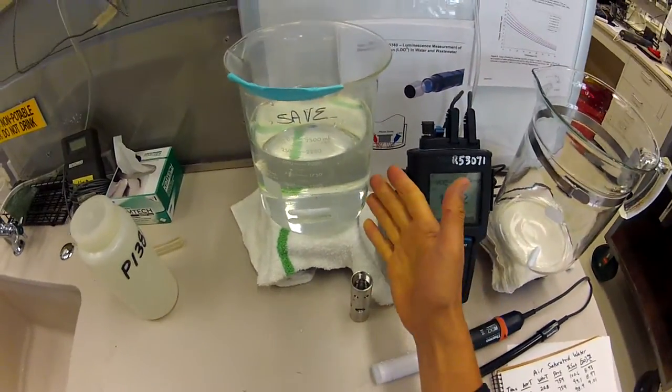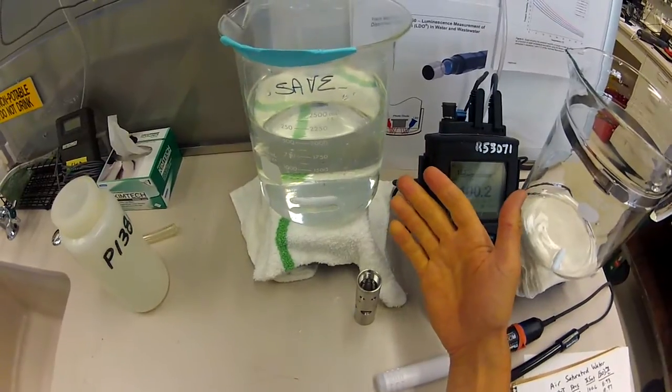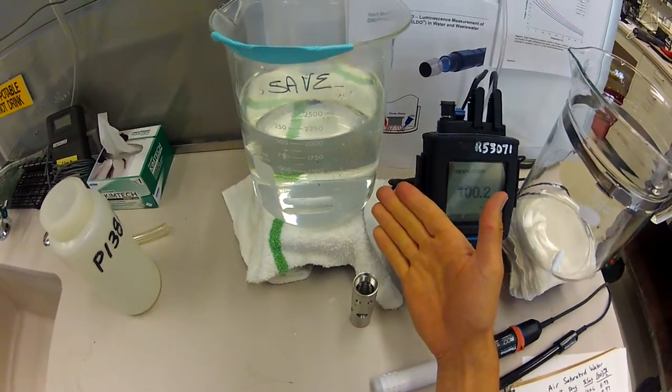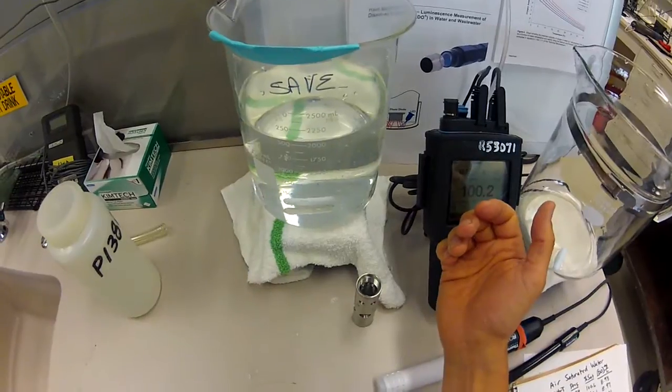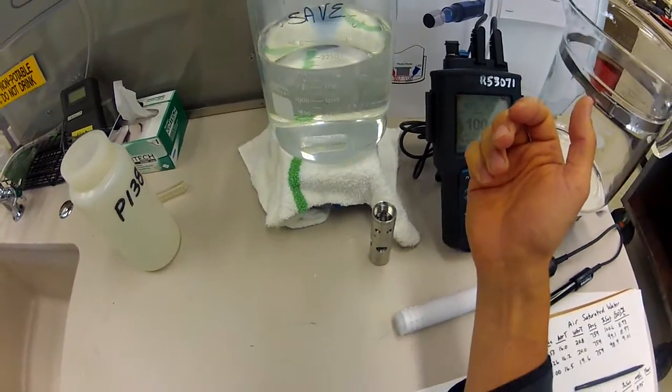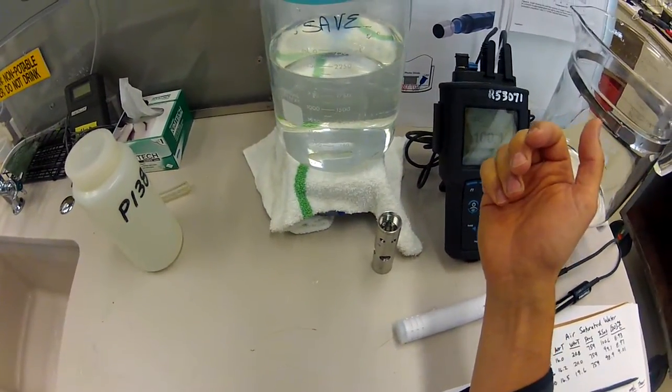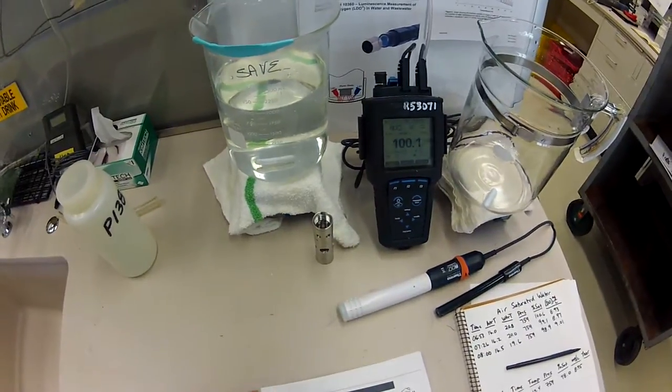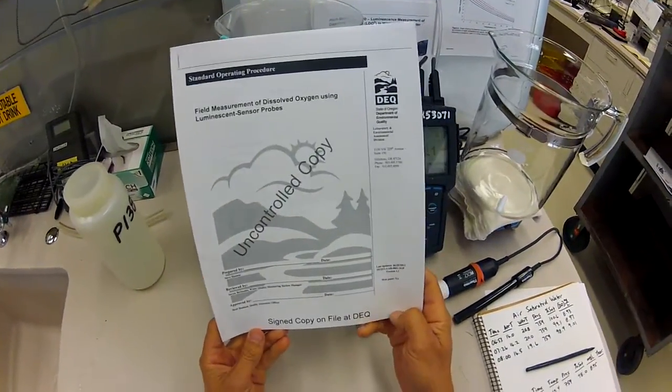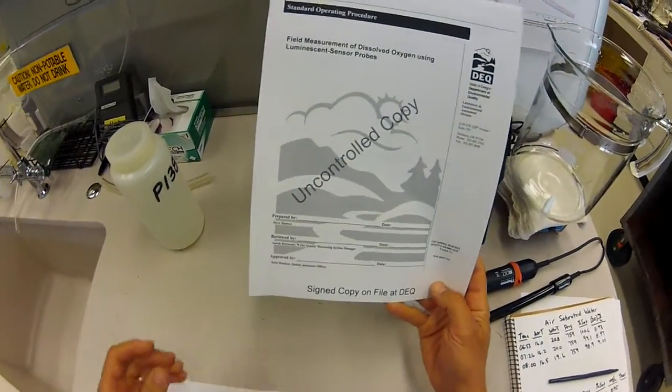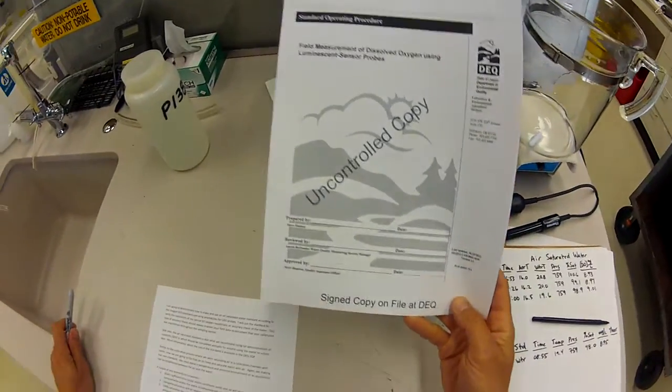This is the same type of standard that we recommend using for doing demonstrations of capability. That should be done annually by anybody that's going to be using the meter to collect data. More information is available in the DEQ's SOP upon request.